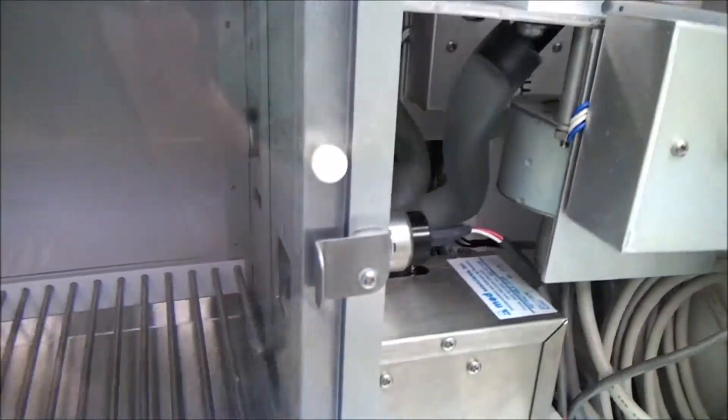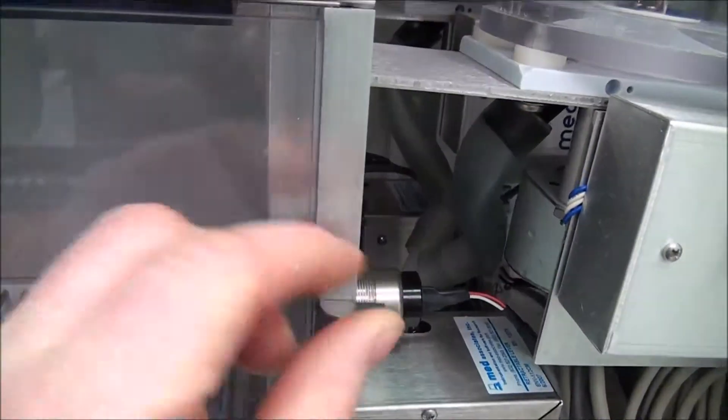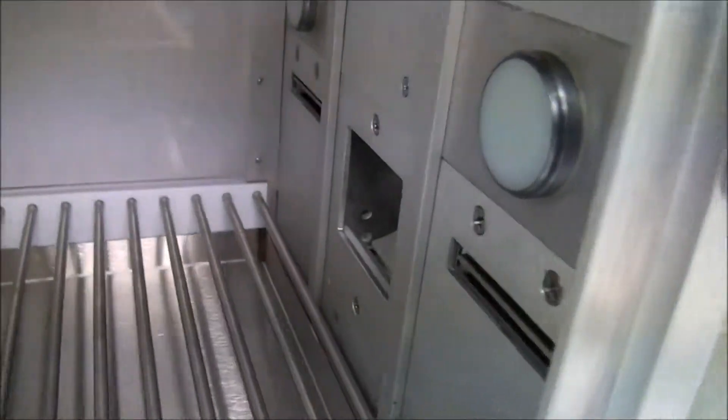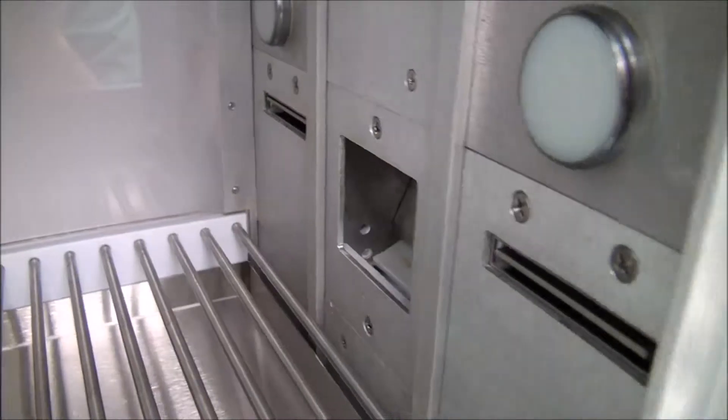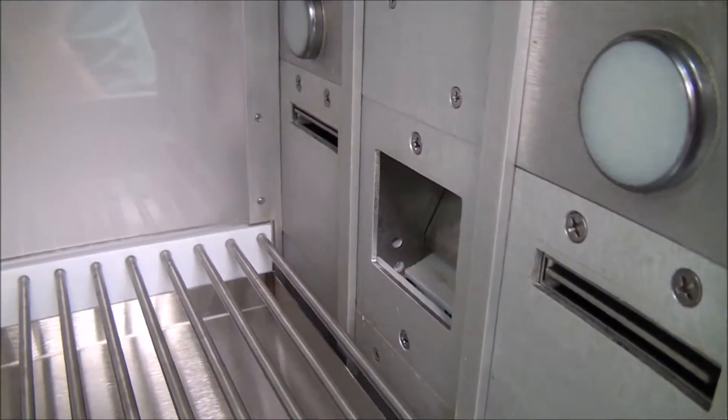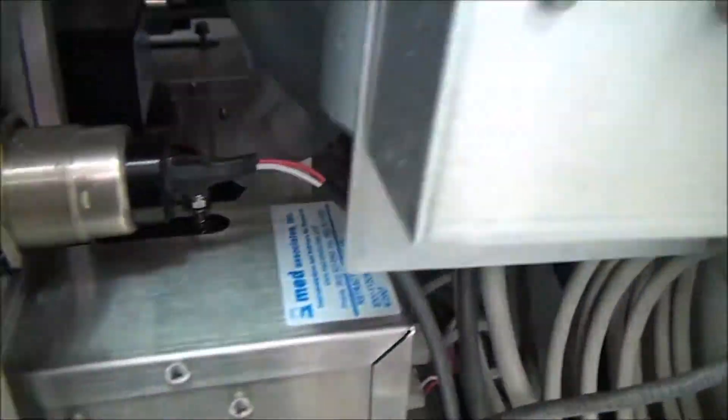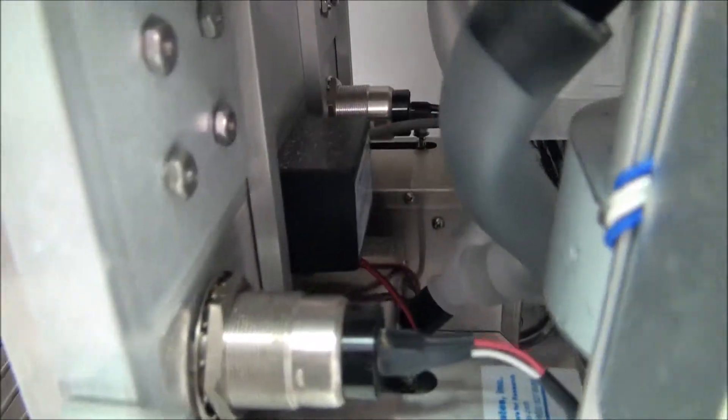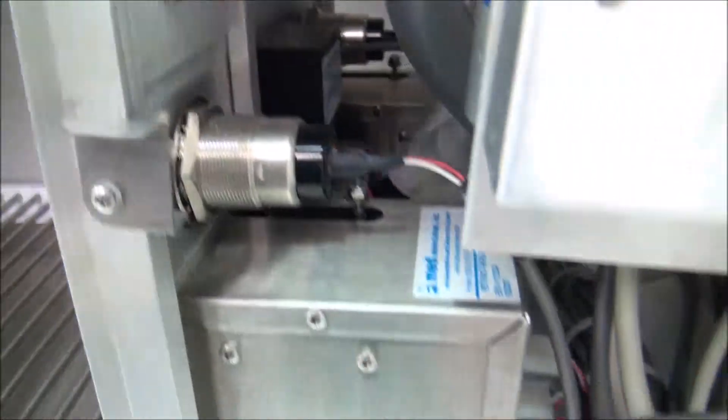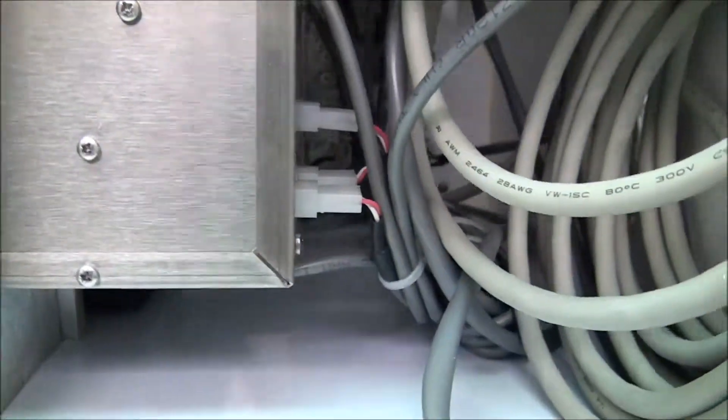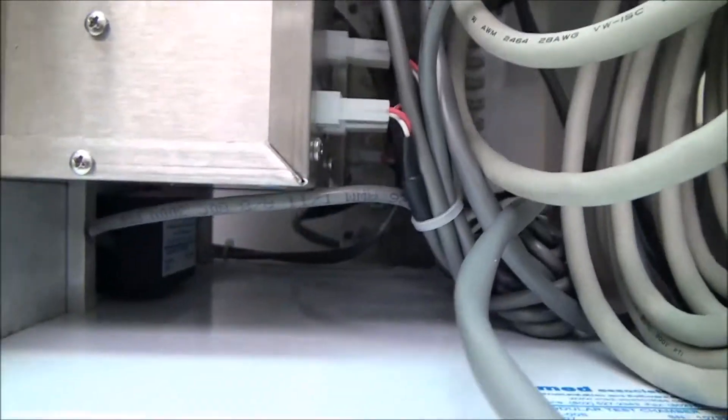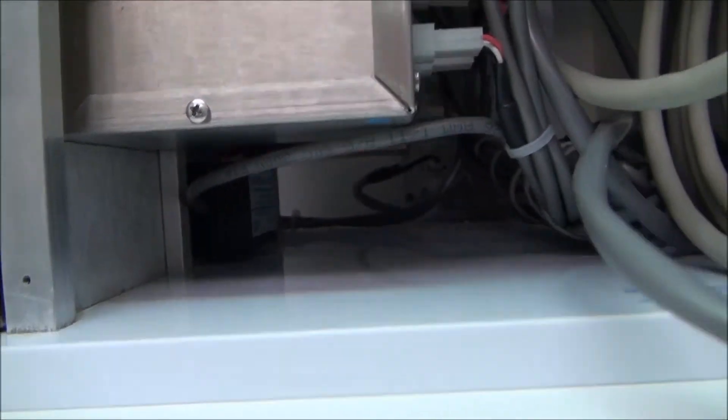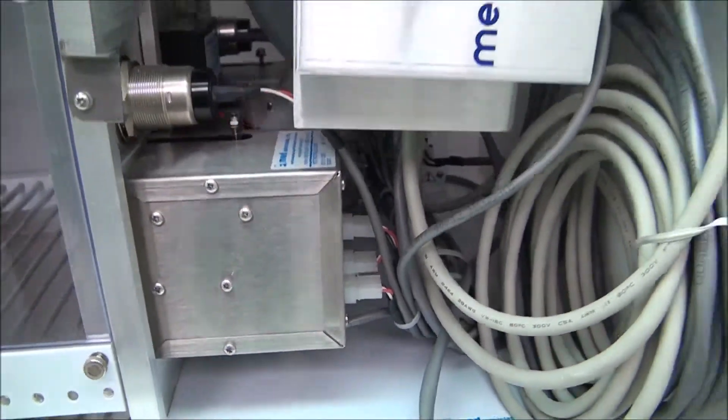It also has two retractable levers. I'll open it up here. Two retractable levers there. And then it also has the head entry module right in there, the box you can see on top of the trough area. And they're also using another head entry module clear down on the bottom there for pellet detection.